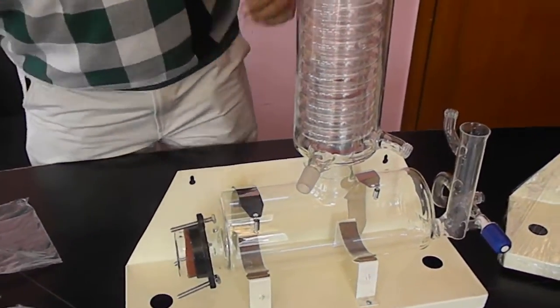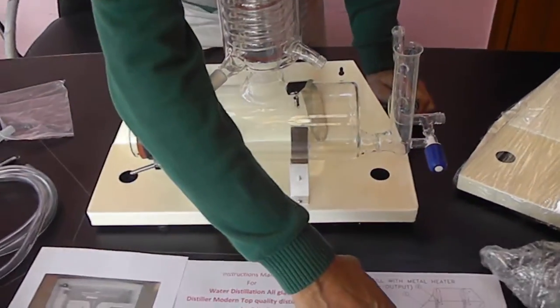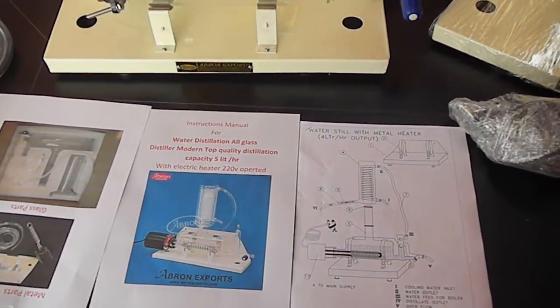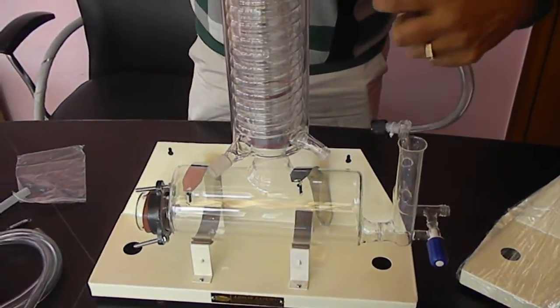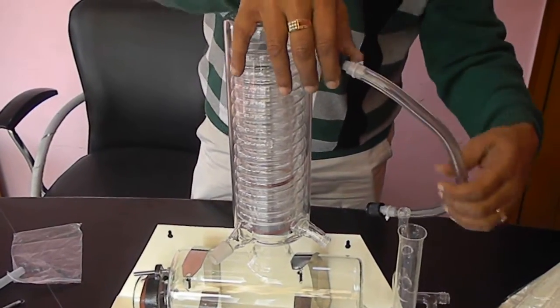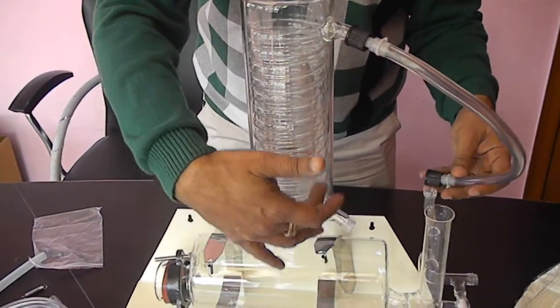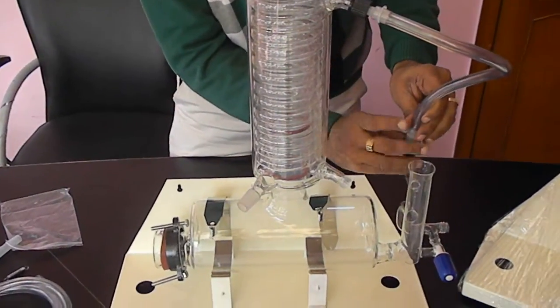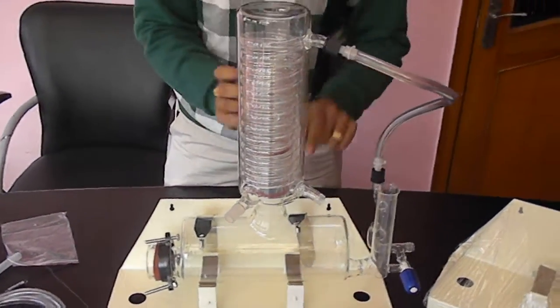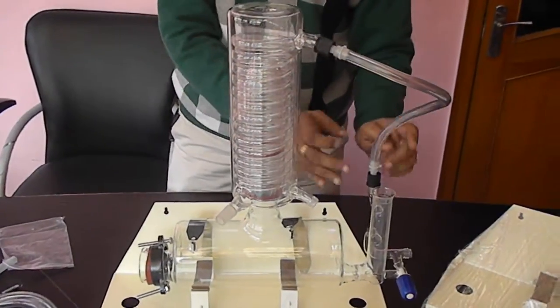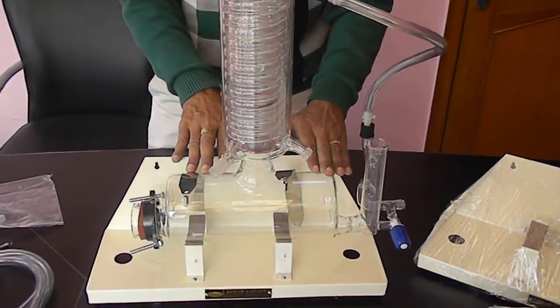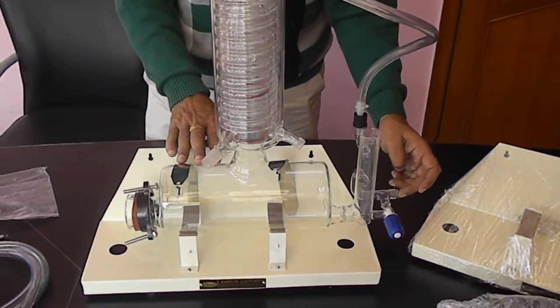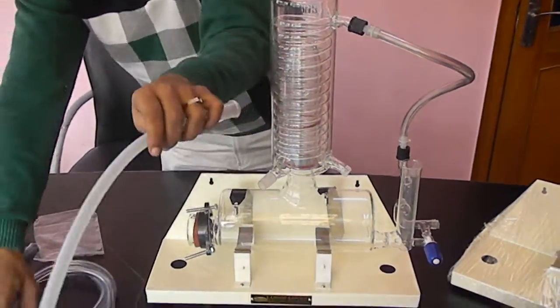Then there is number seven which goes from top to the bottom. You have to connect this. Cold water goes from here, comes here. Hot water comes here and then goes to this part, so that the hot water comes to the chamber and the level is automatically maintained. Extra water comes out through this.